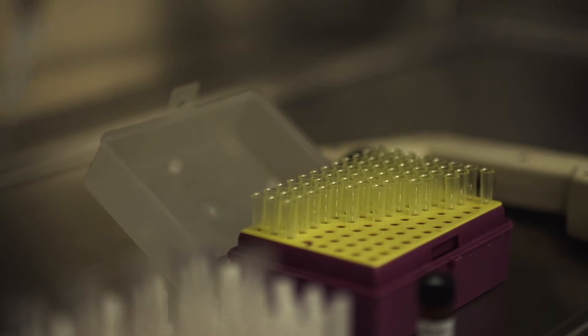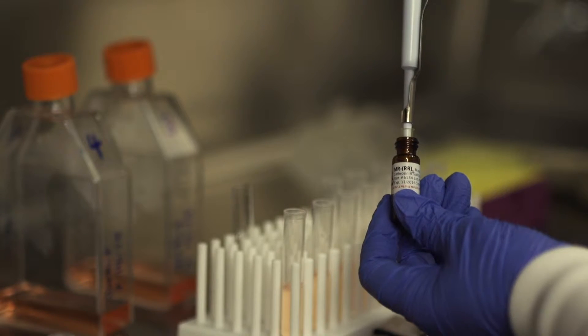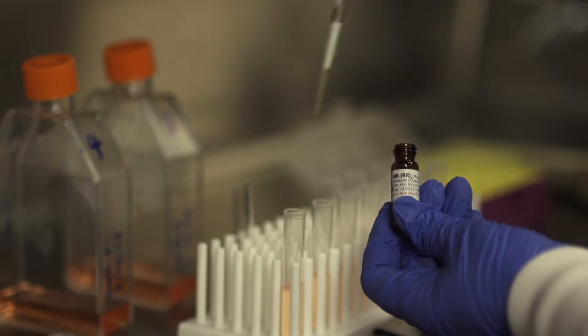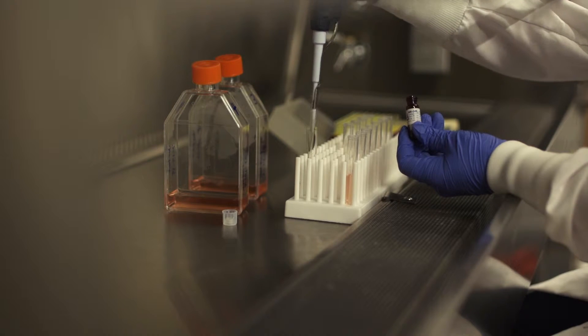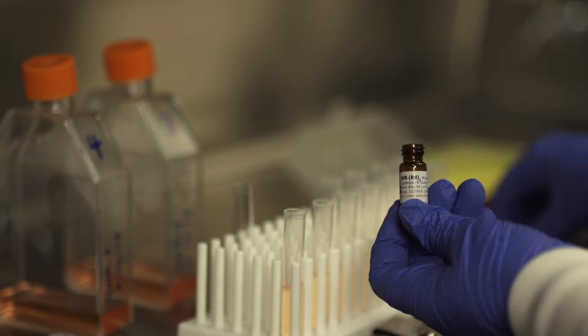Next, reconstitute and dilute the Magic Red substrate and add to each sample. Magic Red is cell permeant and will diffuse in and out of all cells and internal cellular organelles. There's no need to lyse or permeabilize the cells.